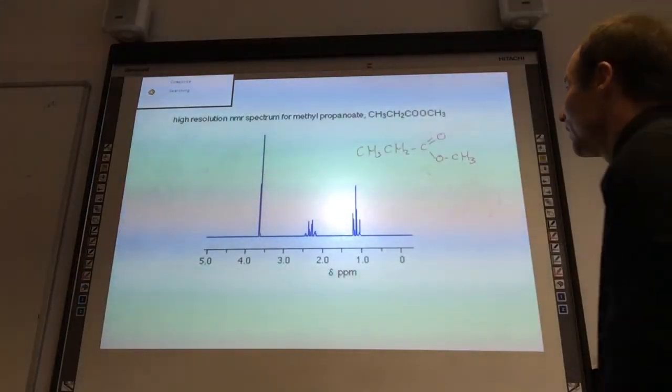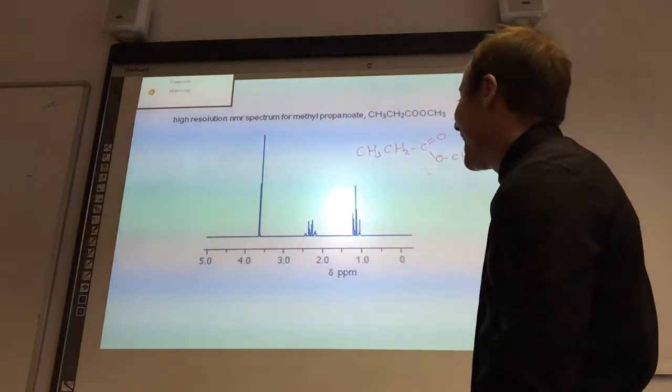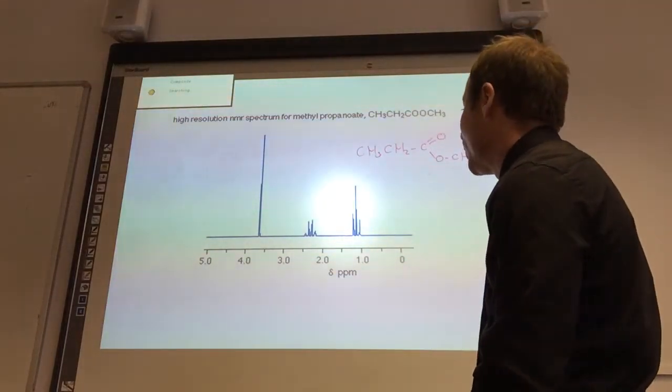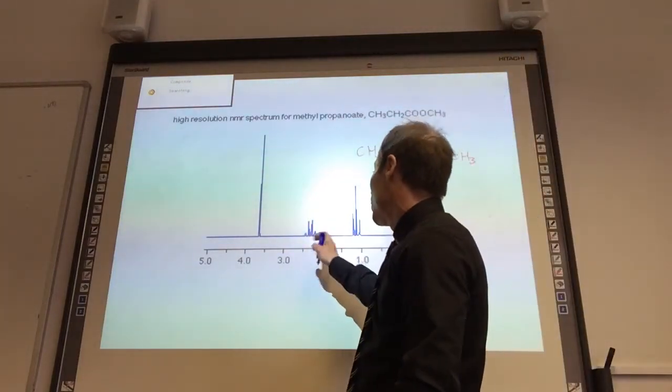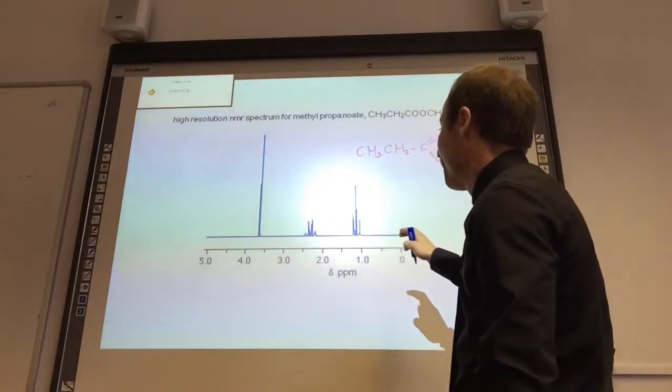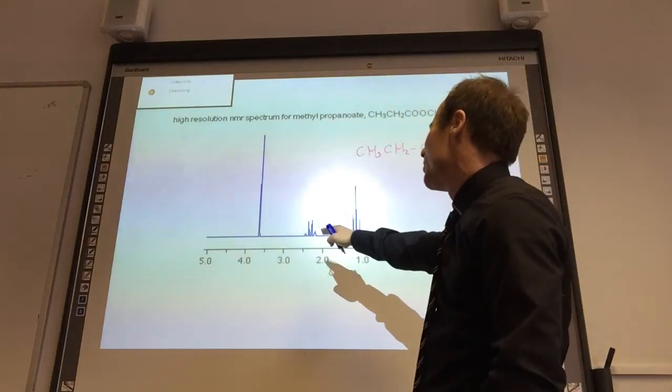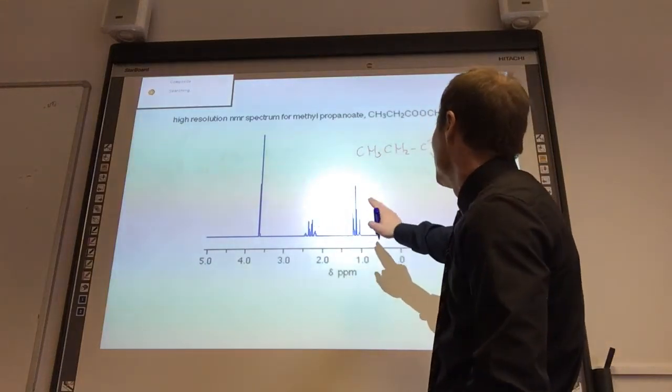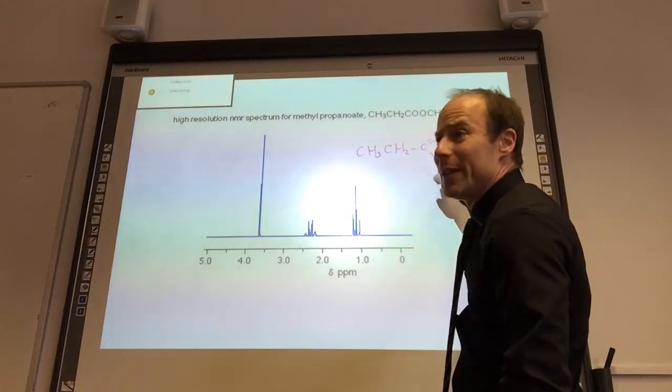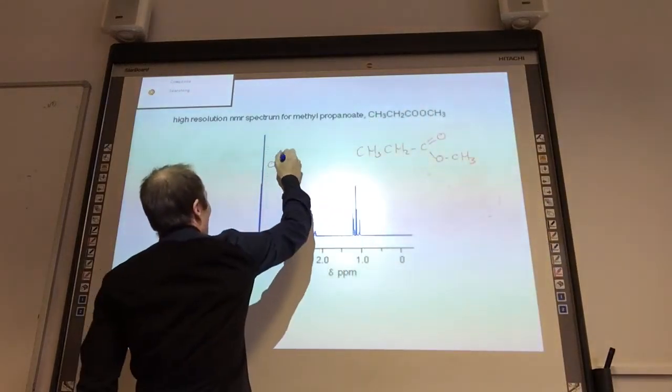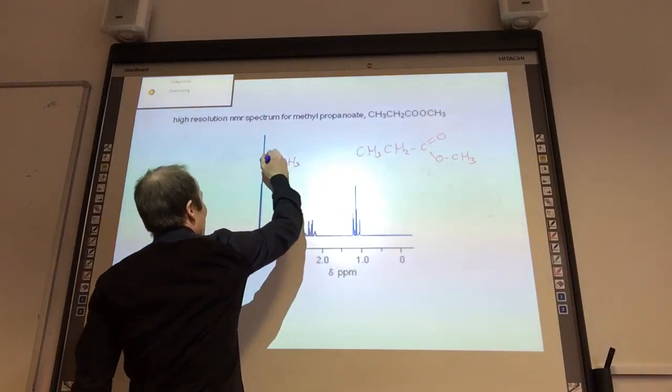Okay, so another ester, methyl propanoate. Again, relatively straightforward to do. I've got a singlet, a quartet and a triplet. Sometimes people call that quartet. Anyway, which one's got to be this CH3? CH3's got no neighbors, so he's got to be this guy, OCH3.